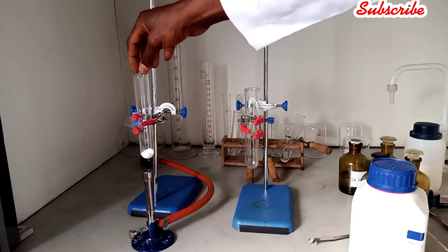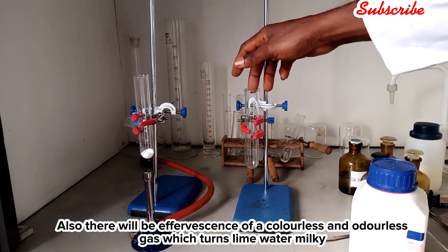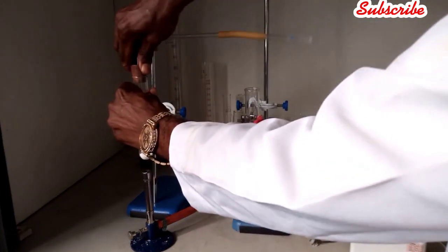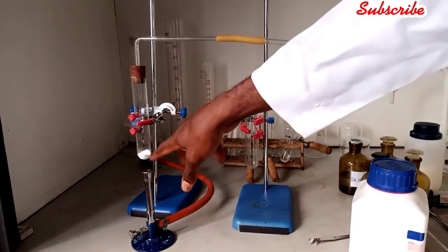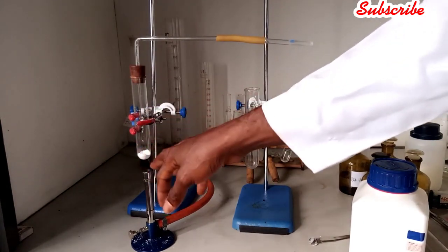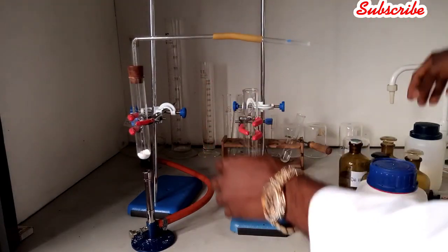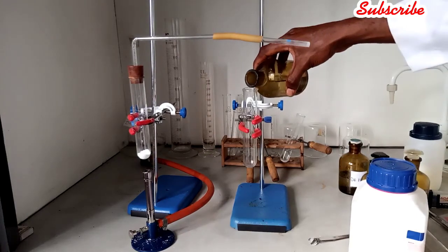Now the gas above, the effervescence of the gas, if allowed to pass through lime water, it will turn the lime water milky. So we'll have to do a little connection here. It's just that we're carrying two tests here. First we heat, it turns from white to yellow, and when you're allowed to cool, it turns back to white. And the gas above here will be passed through lime water, and you observe that it should turn the lime water milky. So this is calcium hydroxide, which is lime water.